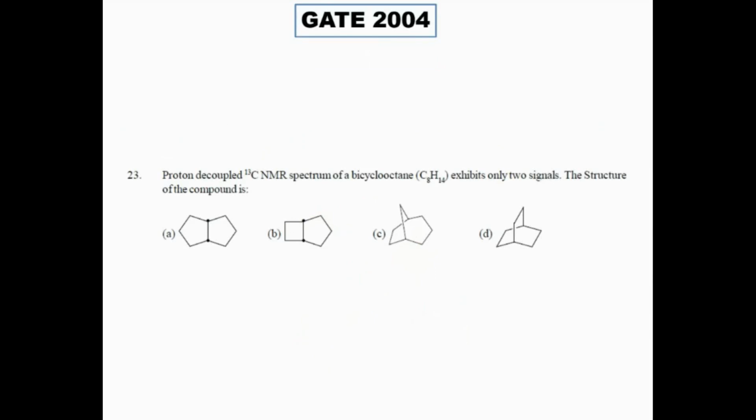GATE 2004 question: in proton decoupled carbon NMR. Did I talk about proton decoupled, broadband decoupled and off resonance decoupled? No? Okay, maybe while talking about splitting, I'll make a small mention of it. So you have proton decoupled and off resonance decoupled.